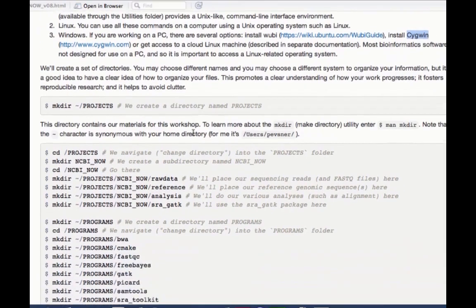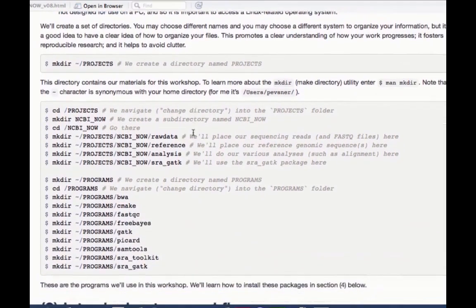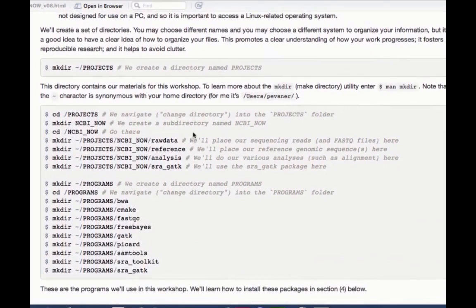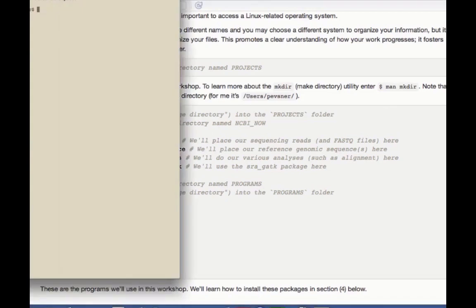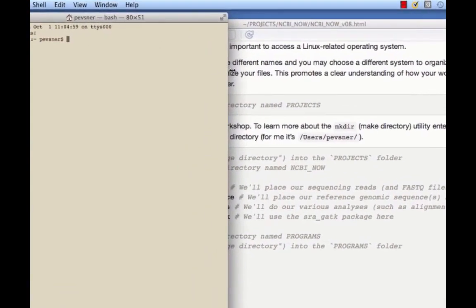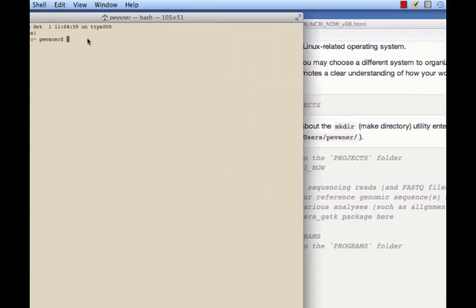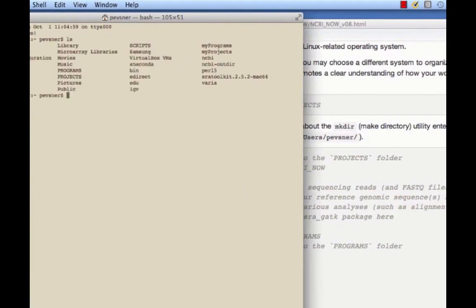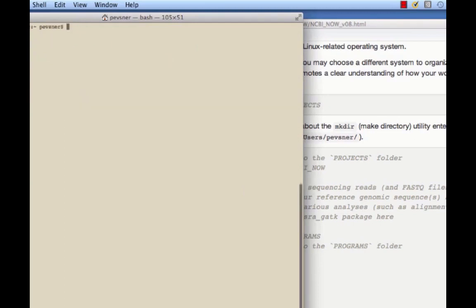We're going to create a set of directories. You can choose whichever file names you would like. I'm going to give you some suggestions. One thing we'll need to do is make some directories. Then we're going to fill them with things. And right now, I'll take you to my terminal, and I'll size it a little bit bigger. And then I'll go ahead and type ls, and that's to list the files that are present. I'll go ahead and type clear. And I'll say that I have a home. I can find that home by looking at my PWD, present working directory.